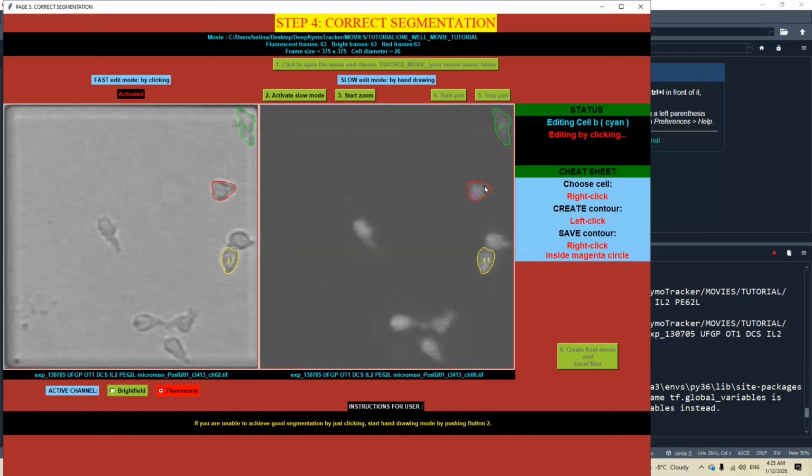In other words, the segmentation error we are trying to correct now happened due to the tracking error. And what we are doing now when we keep left clicking on that cell, we are trying to correct the tracking error. The segmentation neural network takes the coordinates of your clicks and the centroid's coordinates and tries to segment that cell using these coordinates. So our clicking is essentially a trial and error method.